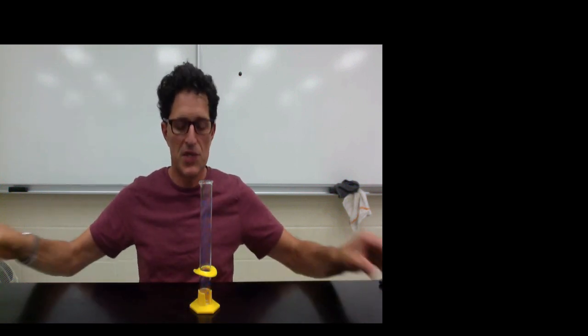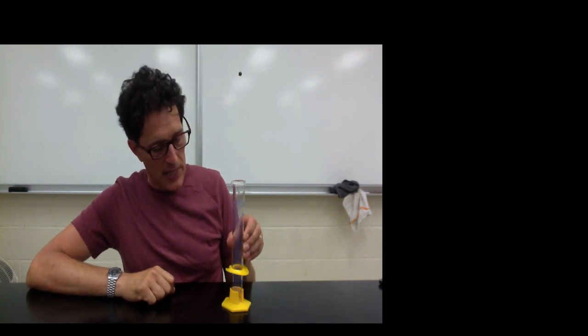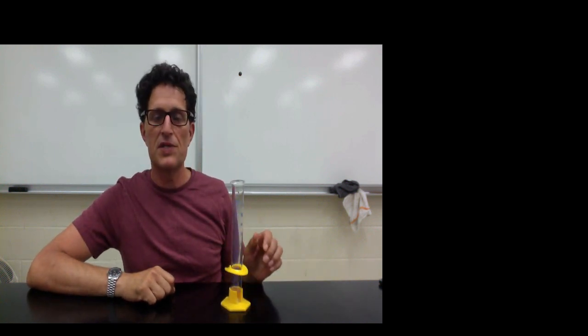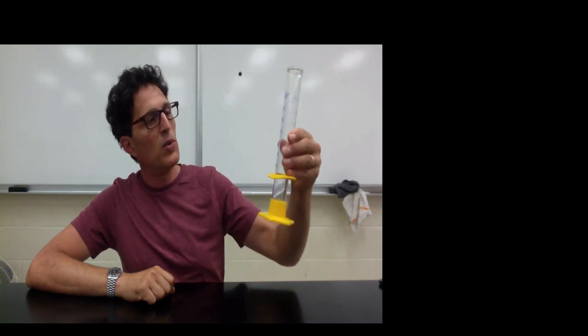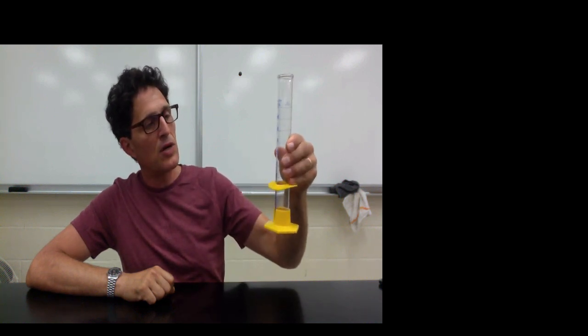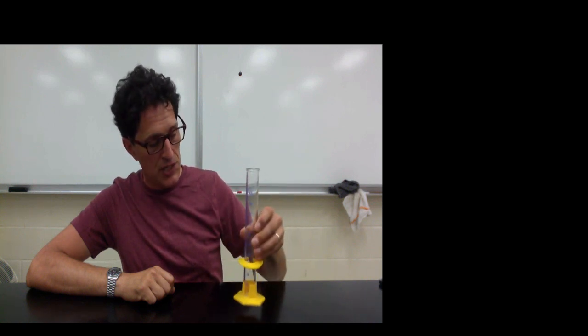When measuring volumes in a graduated cylinder it's important to pay attention to three things. First, you need to make sure that your graduated cylinder is sitting on a level surface. This is to avoid the problem of not holding your graduated cylinder correctly vertically and not reading the volume correctly. So always place your graduated cylinder on a level surface.